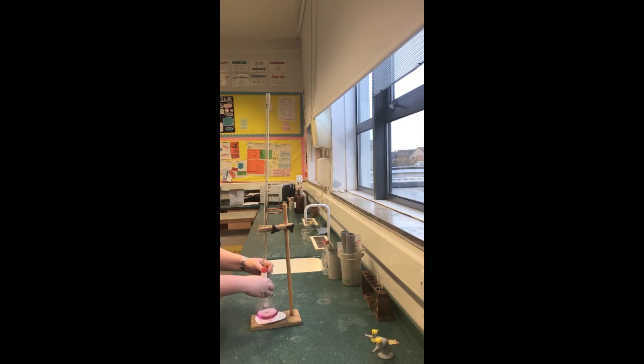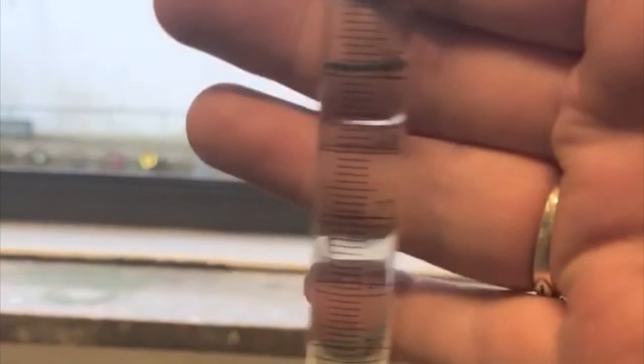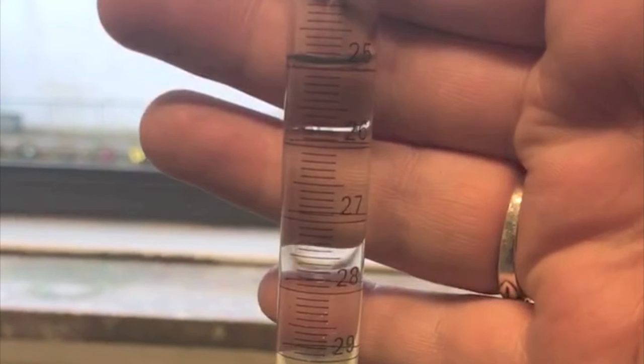The end value from the burette is then noted. In this case, it was 24.9. The added volume, called a titer, is calculated. For this titration, it is 20.1.